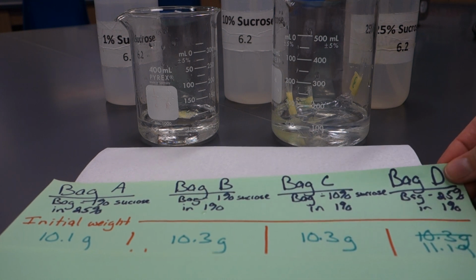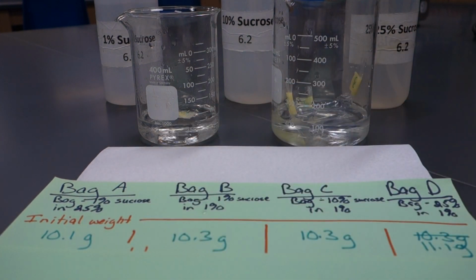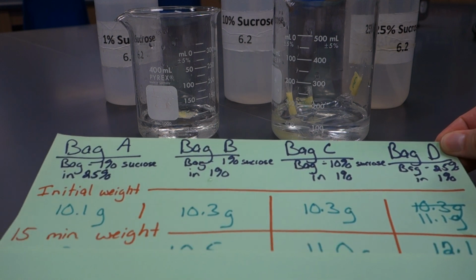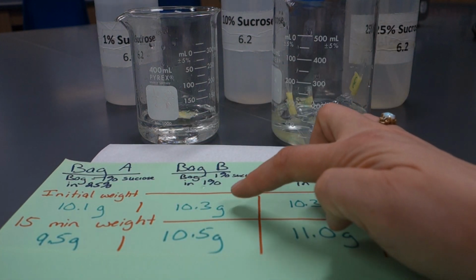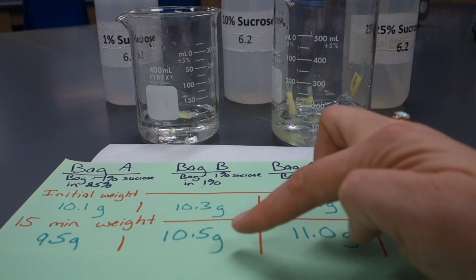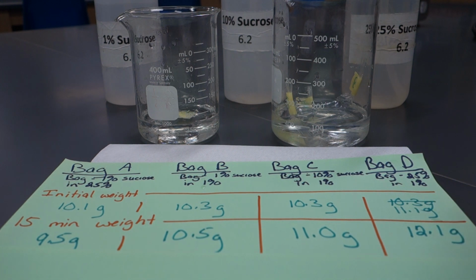So we started with an initial weight for bag A at 10.1 grams. And bag D was already a little bit heavier at 11.1 grams. But after 15 minutes, it's already obvious what happens with these solutions. At 15 minutes, bag A lost weight. Bag B gained a little bit of weight, so we'll have to watch that one, because that's the one we're expecting to stay about the same. Bag C gained a little bit of weight, and bag D gained even more weight than bag C did in proportion.